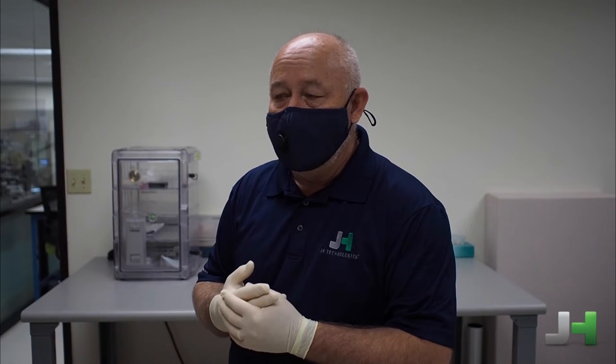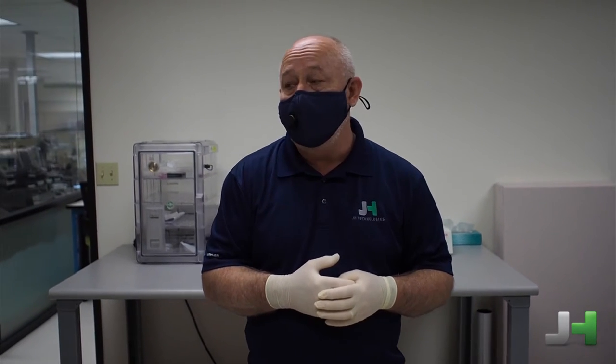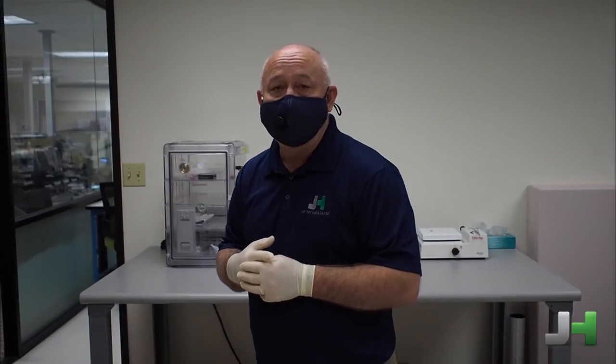Along with this equipment, we not only offer these tools for demonstration purposes, so the customer can get a sense of how they function and how they'll work for them. But we also provide services as well. So sample preparation as well as imaging and analysis service through the SEM. So if you have an interest in services, we'd be happy to help you with that.